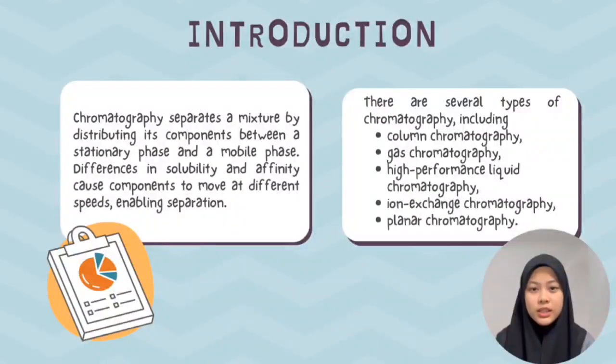Chromatography is a technique to separate a mixture by distributing components between a stationary phase, solid or liquid coating, and a mobile phase, liquid or gas. As the mobile phase moves, components interact differently. Some stick to the stationary phase and move slowly, while others dissolve in the mobile phase and move faster. This difference enables separation, making chromatography essential for analysis and purification.